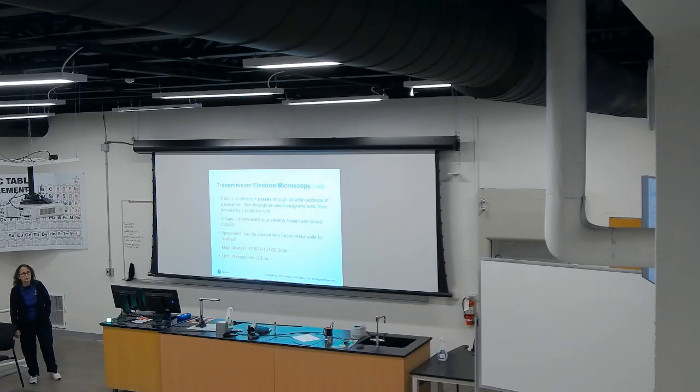So we have TEM, transmission electron microscopy. This uses very thin sections of the specimen, and then you will have these images sent into this software.